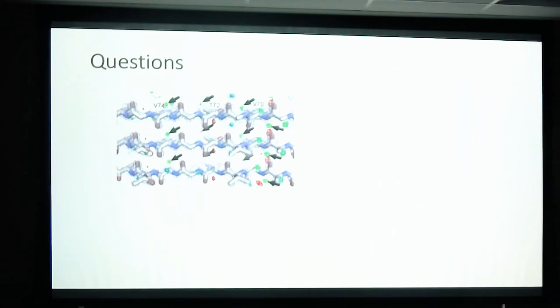I'm not sure about the smallest. Would you know the smallest crystal you can do? Well, it depends. With microED, you can do submicron. It also depends on whether the crystal dies. Some people choose longer crystals, a few microns, so they can collect from multiple areas on the same one, because they might not get completeness. You might rotate the crystal 9 degrees and it dies. But the smallest for a complete data set, I don't know. It has to be on the order of the microfocus beamline, which is still a couple of microns, I think.